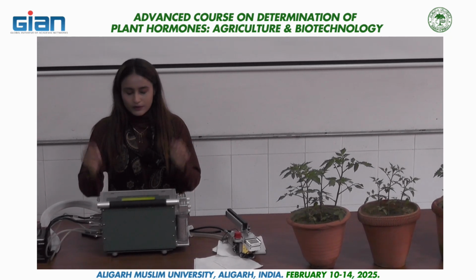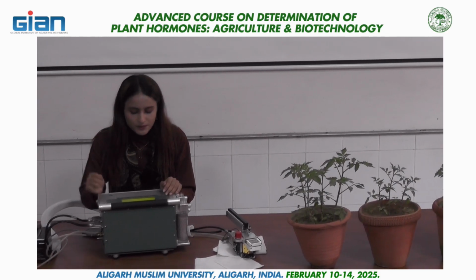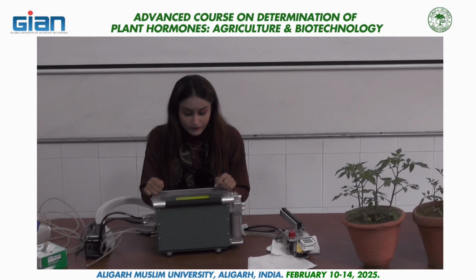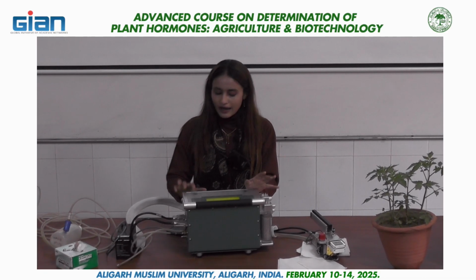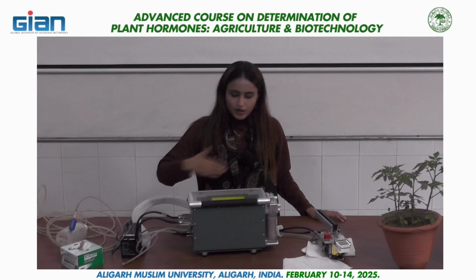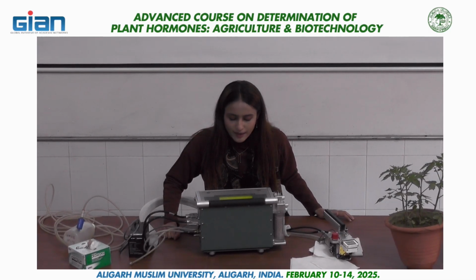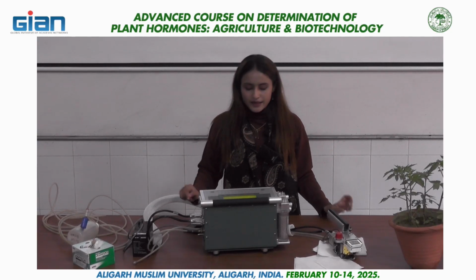So you can see in this display we have three options. One is Arabidopsis chamber, second one is default fluorometer, and third one is factory default. Just you have to enter here because we want to use the factory default system. Enter. Now processing is going on. Now they are asking, is the chamber IRGA connected? So you can see that the chamber is connected.